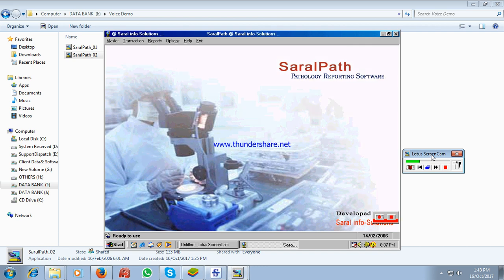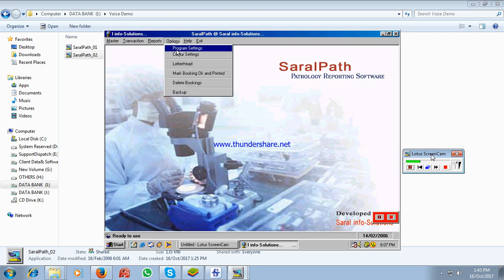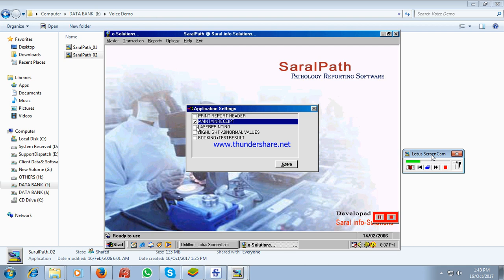In case the printer is a laser printer or a desk jet printer or an inkjet printer, we'll select this option, and if it is a dot matrix printer, we will deselect this option. Highlight abnormal values. In case we want the abnormal values to be highlighted in the test structure, we'll select this option and the abnormal values will be highlighted. In case we want the booking and the test result to happen in a continuous way, where there is no gap between booking and test result, we'll select this option and save it.